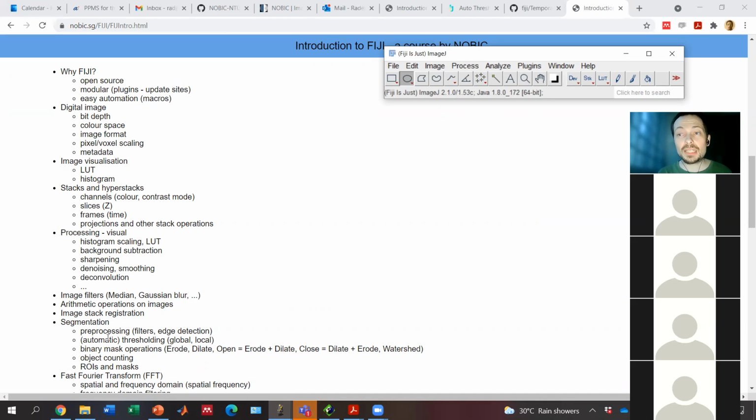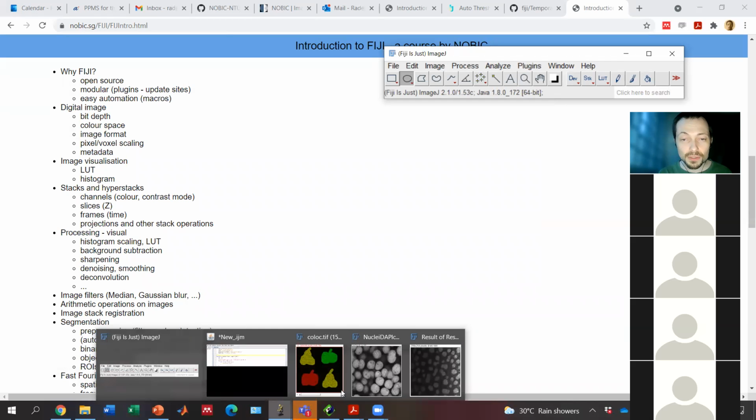So that's already getting us to the analysis part, where we want to measure objects, count objects, and do such things. So typically, before we do the segmentation, we might want to do some form of pre-processing, such as apply some filters. Let's again look at some examples.